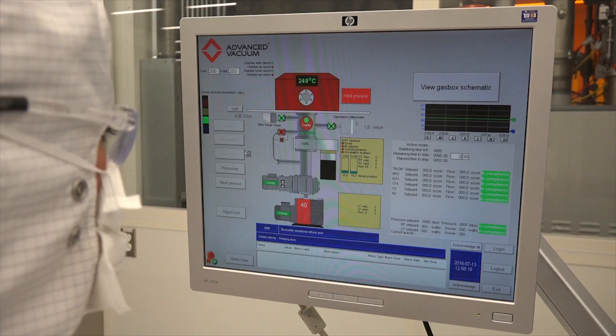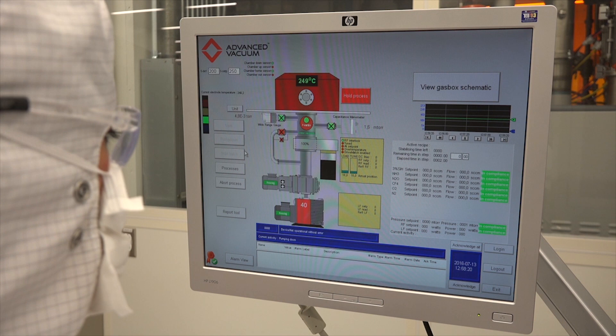when we deposit silicon dioxide in this system, the deposition rate is 35 nanometers per minute. After a few minutes of pumping, we reach our desired chamber pressure. Now, we will select the material we want to deposit and enter the desired deposition time into the computer.